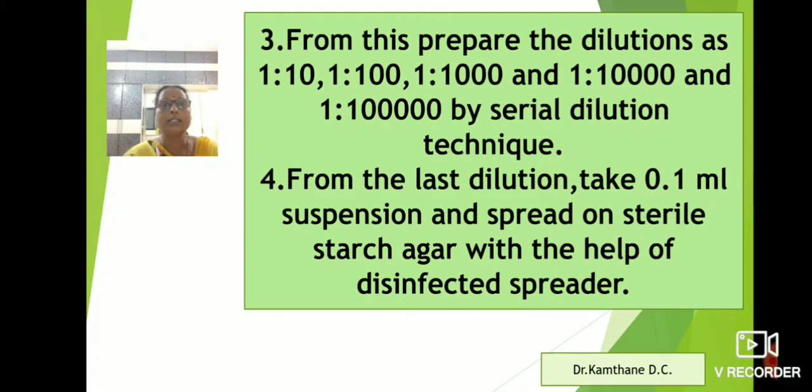Firstly, take 1 ml soil suspension which is heat treated to 9 ml sterile saline, this is giving 1:10 dilution. From this again transfer 1 ml to 9 ml sterile saline, this is giving 1:100 dilution. Likewise, prepare the dilutions up to 1:100000.